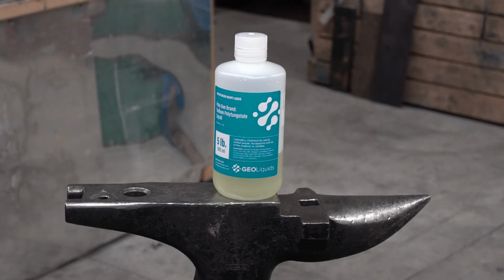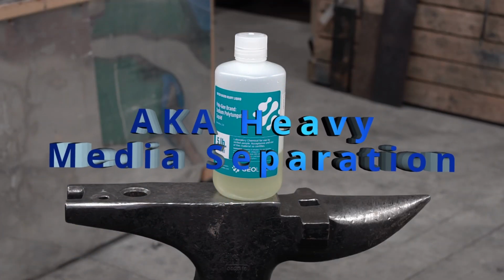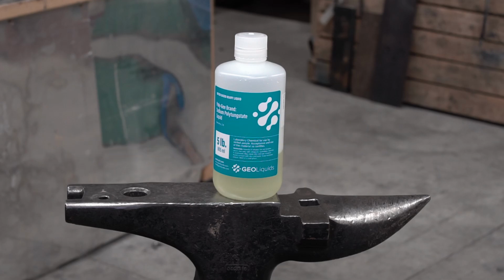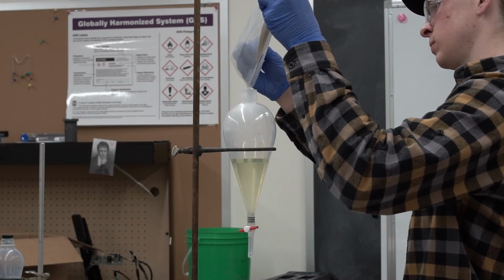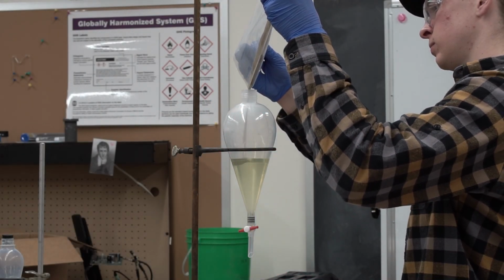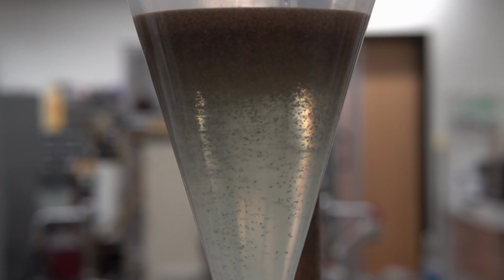Well, one of those purposes is dense media separation, which is a process in mineral processing where you use a dense media, in this case sodium polytungstate, and your mineral, the lighter section floats and the heavier section sinks, and it's a pretty cool process.